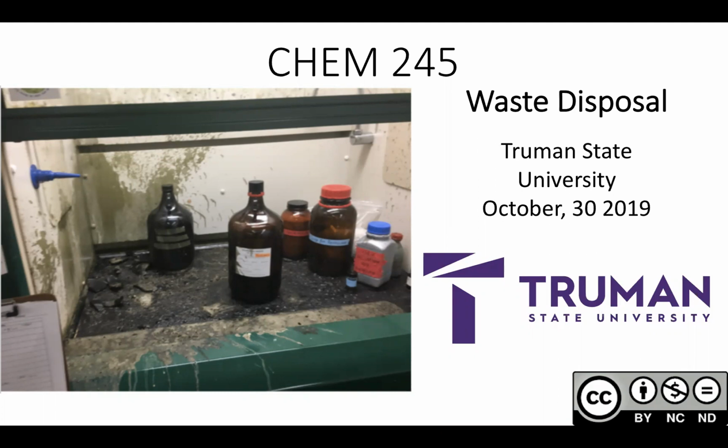Oops. It turned out that this bottle was releasing a little bit of heat, maybe degassing a little bit, and then was capped accidentally. At which point the pressure blew up, and sometime over the weekend we ended up with this. So again, this is one of the important illustrations of why so many of your instructors care so much that you put the right waste in the right bottle, because otherwise, well, this happens.